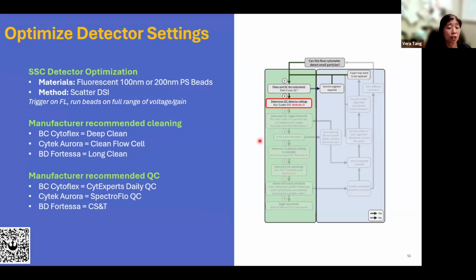The next part is to optimize our detectors. So generally, when people are looking at their cells, they will more often than not optimize their settings according to their sample. And nowadays, I think more and more people are familiar with the spectral platforms, which come with application settings that are already inbuilt and optimizing the instrument. So this is not as foreign a concept. So what we're doing here is optimizing the detector settings using some reference materials as well.